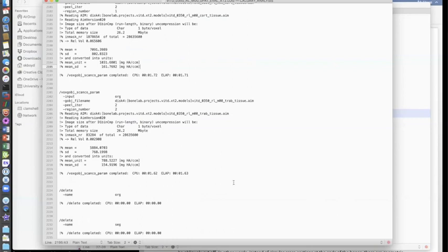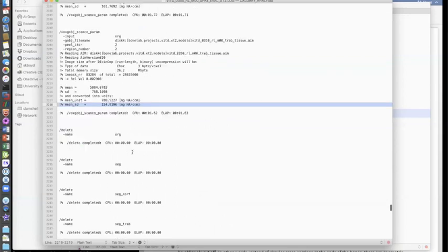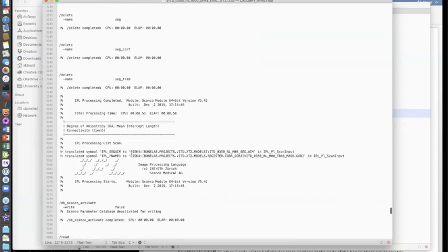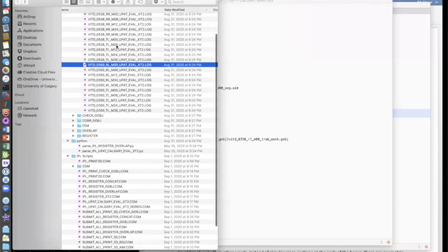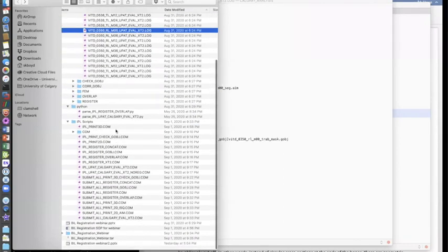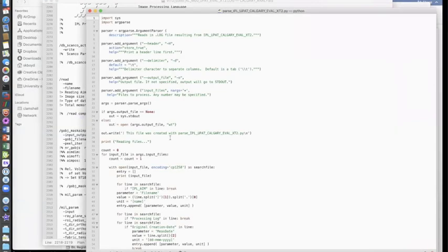If you were to try to do this for all 4,000 scans, you of course would have huge errors and mistakes. But as long as you've done the analysis consistently, then all these files are consistent. And so what I've done is I would take all of these log files and download them onto my PC. I have to make sure they're in ASCII format. And then I run a Python script. And the Python script has some arguments that I can define.